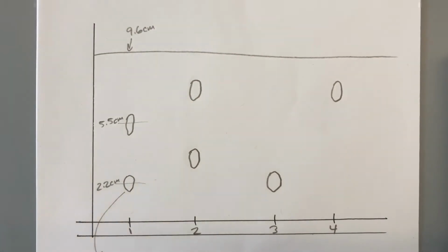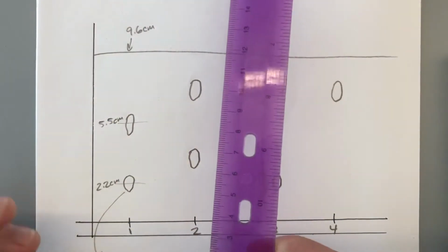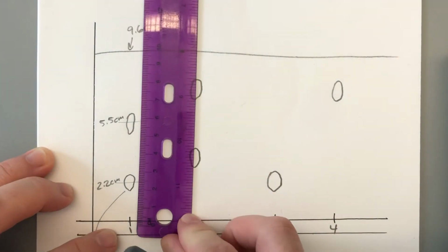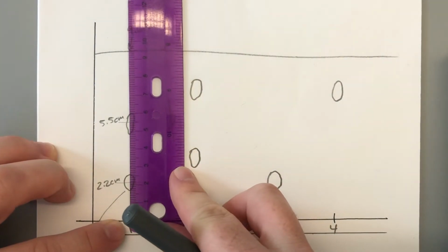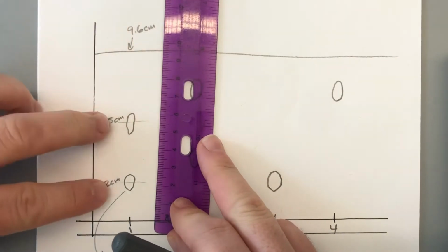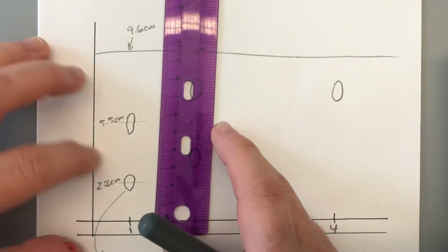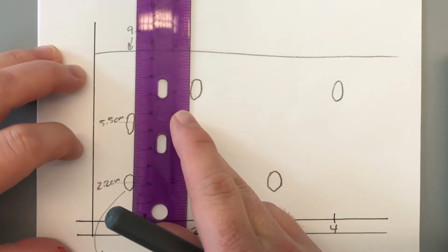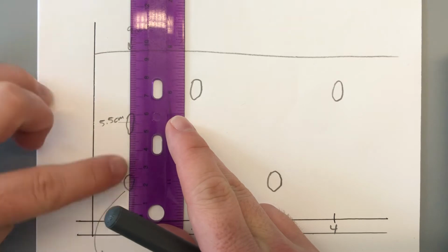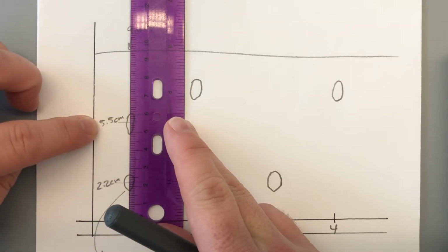And so what you would do is you would measure from the baseline, use the metric system, please. Do not do this in inches. And what you would do is you would measure from where the spot started up to the solvent front. And I already labeled it, but the value comes out to 9.6. Then you're going to measure from the center of each spot. Okay, so from the line to here is 2.2. From the baseline to here is 5.5.